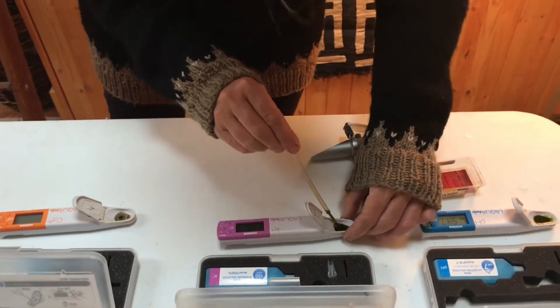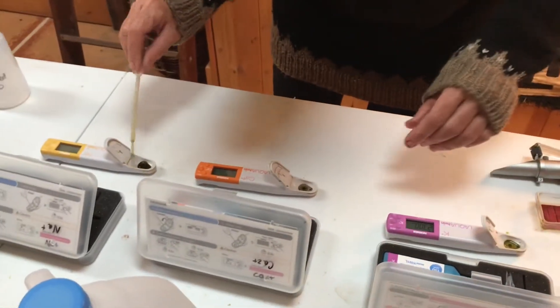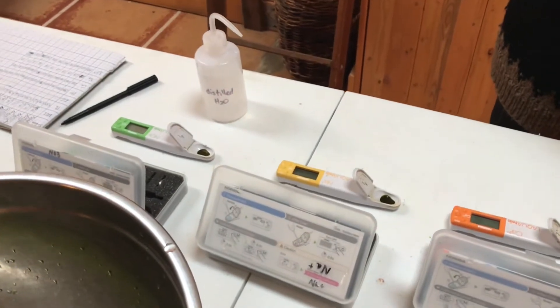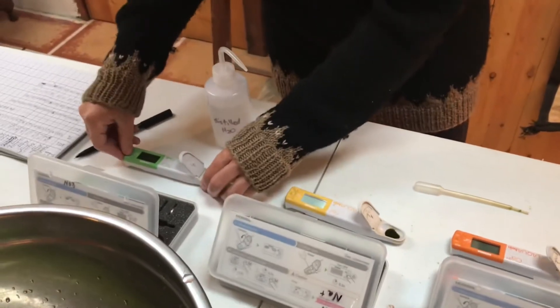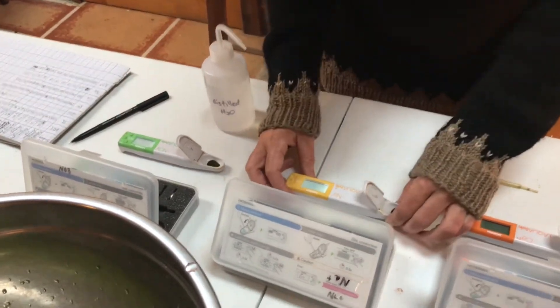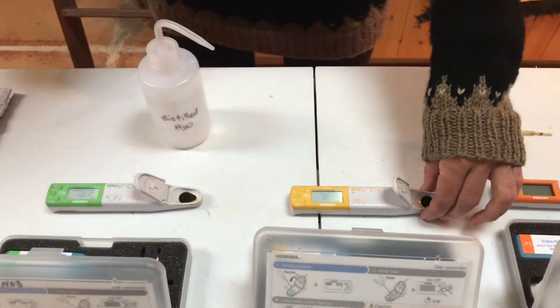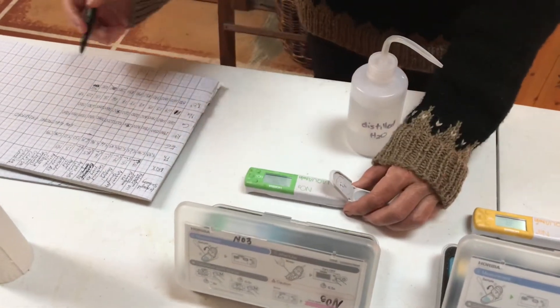Then we spread the sap to the other meters with the pipette. Turn them on — I'll do the calcium in the middle once these ones are ready. The sodium is 38, and the nitrate is 820.